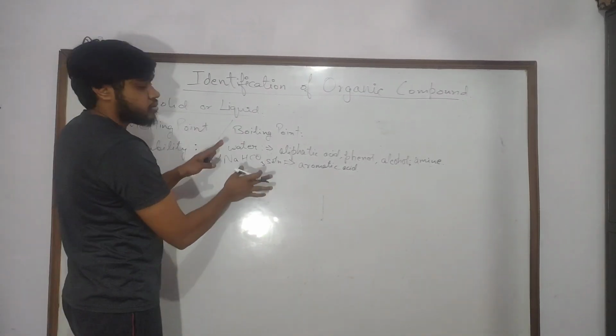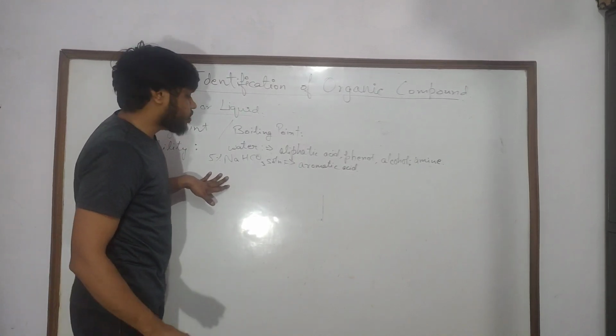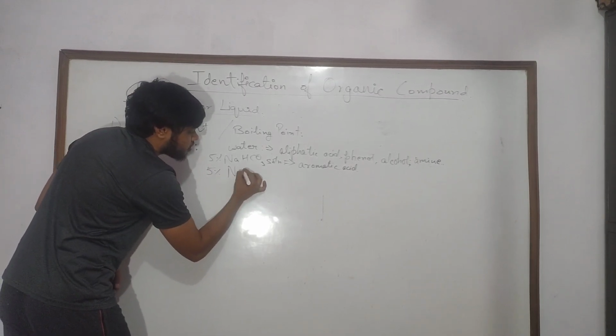Then if our compound is insoluble in both the water and sodium bicarbonate solution, next we check the solubility in 5% sodium hydroxide solution.